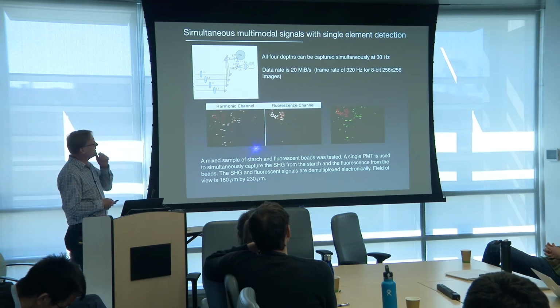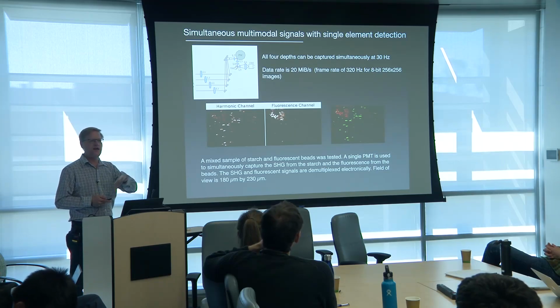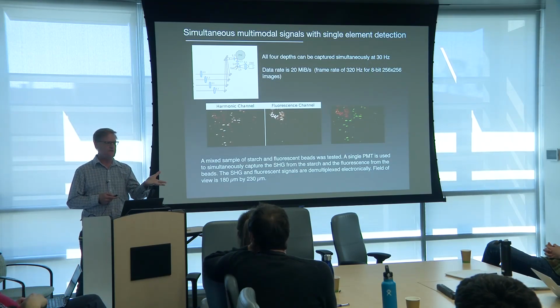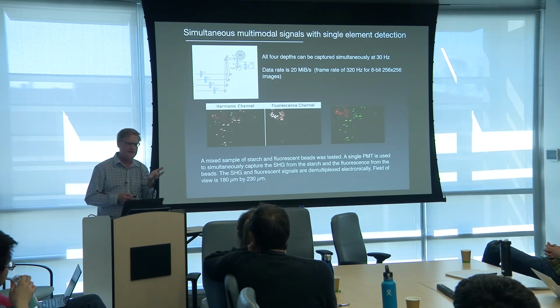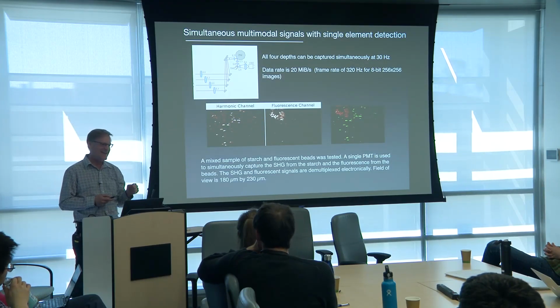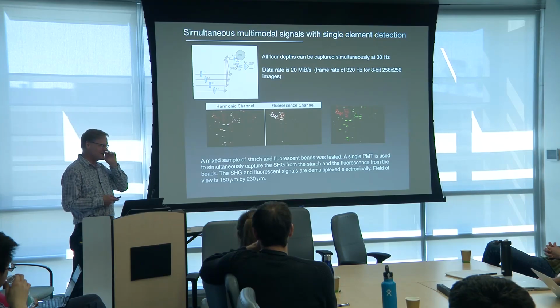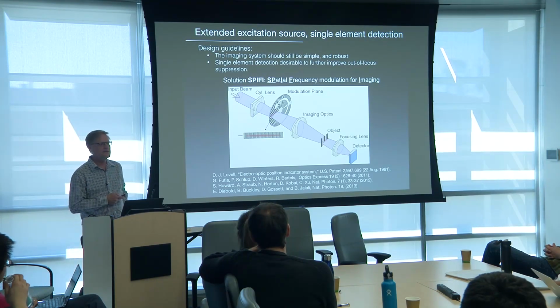Okay, so that was nice. These are pretty complex systems. And so was there a compromise that we could do? Could we go back to our extended line source and its simplicity, which is really like 100 beams in parallel, because it gets back to Shea Wong's question, could I do 100 beams? When I presented that system initially, Winfried Denk asked me that actual question ages ago. He said, well, I've got schemes to do 100 beams. How I do 100 beams simultaneously is our next topic, as we go back to our line.